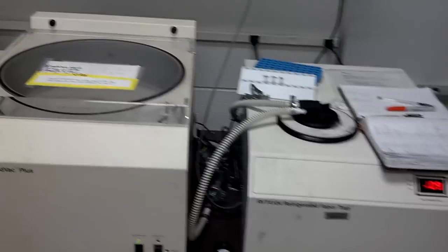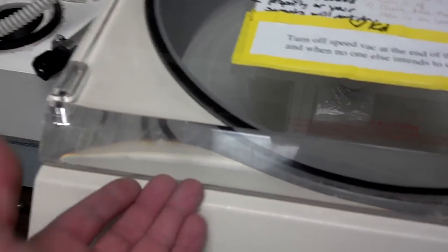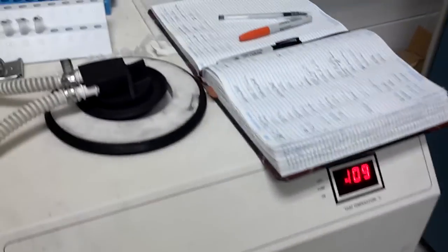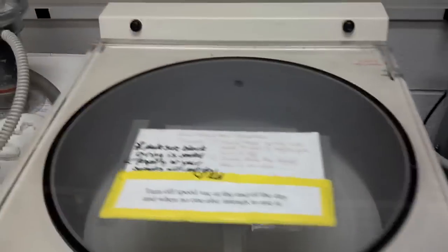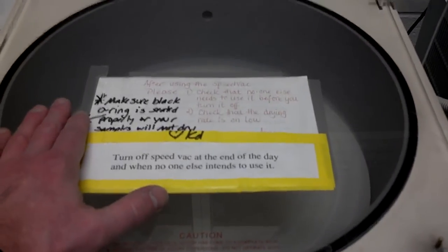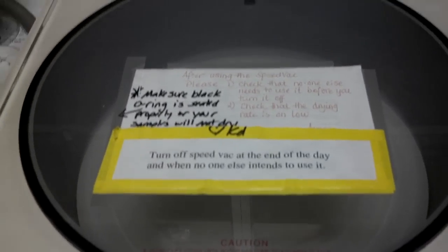This is called a speed vac. As you can see it's spinning. It's also under vacuum. What it is is this is under reduced pressure and it's slightly heated. So you put your samples in there and the solvent evaporates. It dries them out.